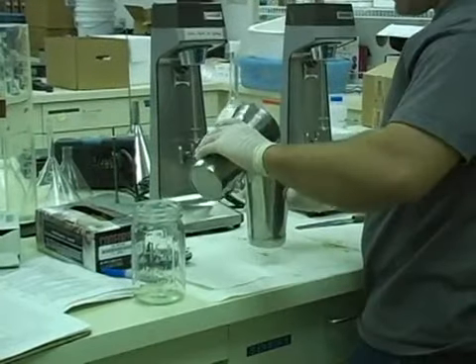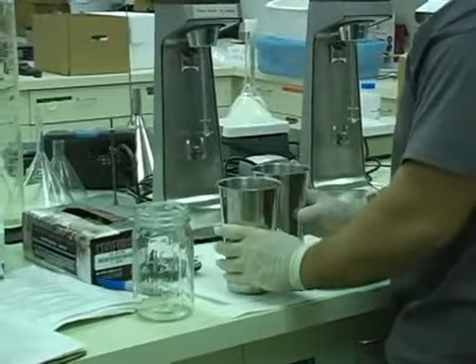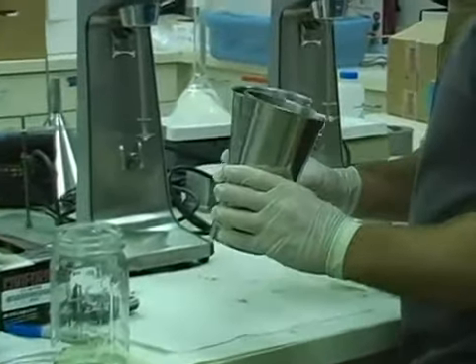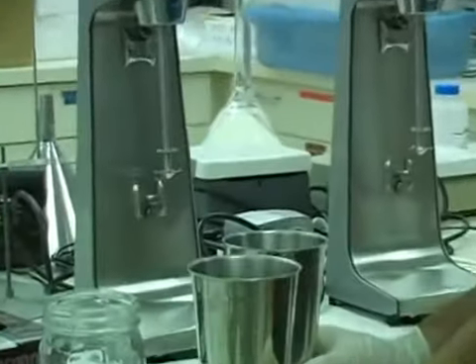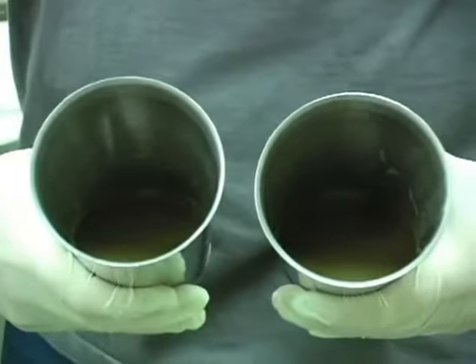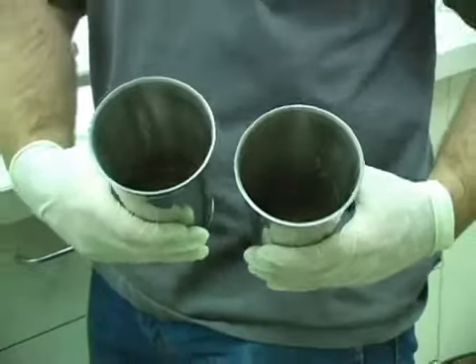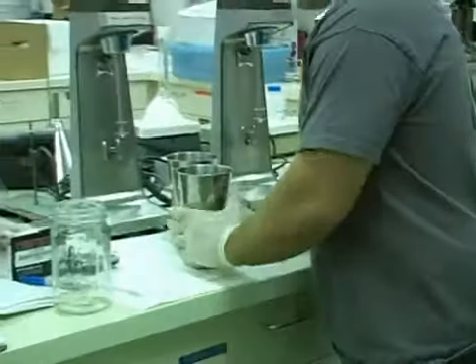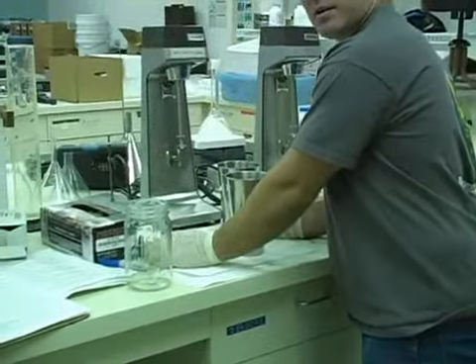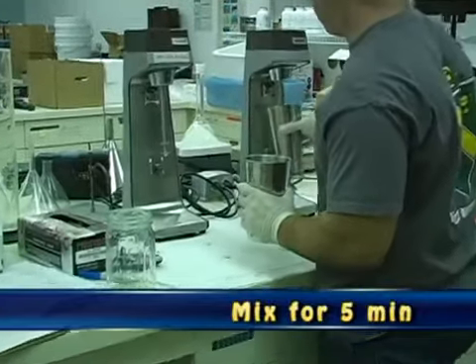Okay. So once we make sure that the level of liquid in both these cups is about even, okay, about that much liquid in each one. If you have too much more than that, then it'll fly all over the place. So we're gonna clear out the timer and start it, and we're gonna put both of these on the machines for 5 minutes.